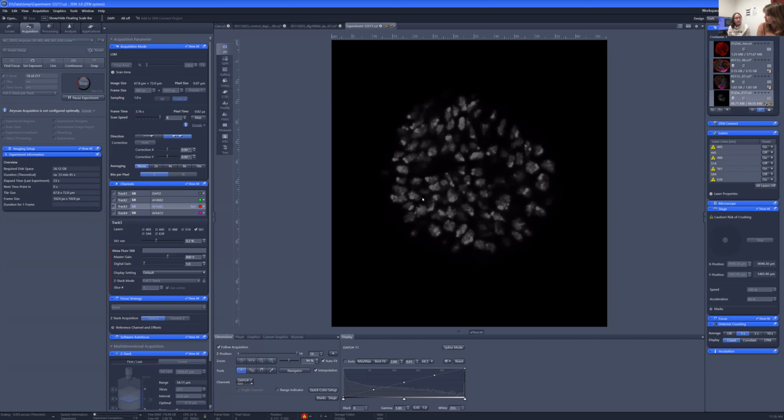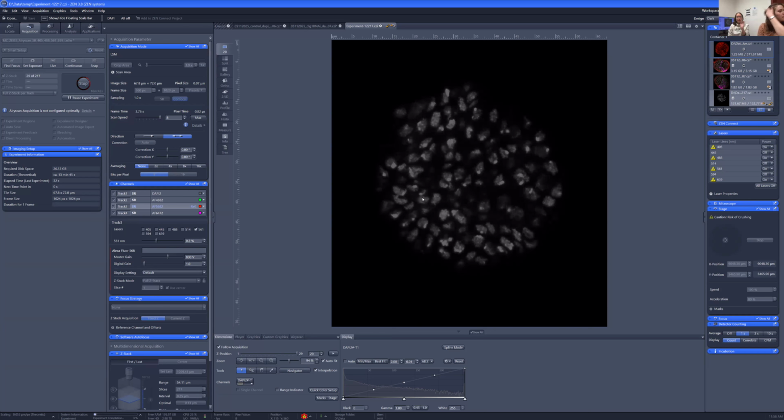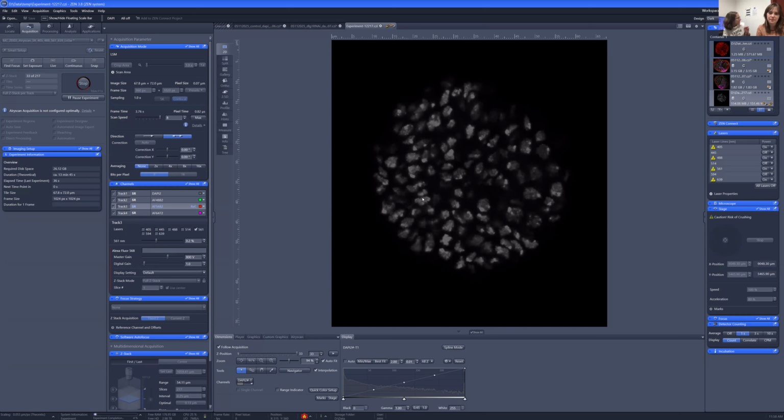Oh, you're already starting your image? Yeah. Oh, great. Well, how about you go back to talking about the person you're collaborating with to do some quantification? Yeah. So really quickly, what you're starting to see appear on the screen is just.